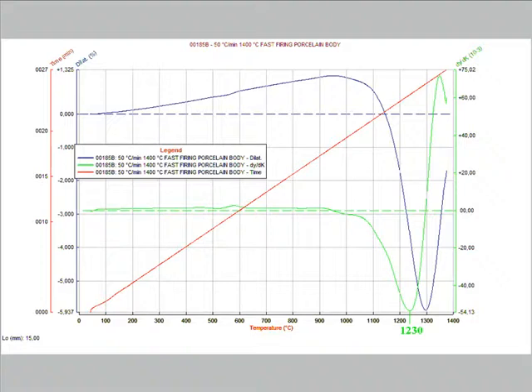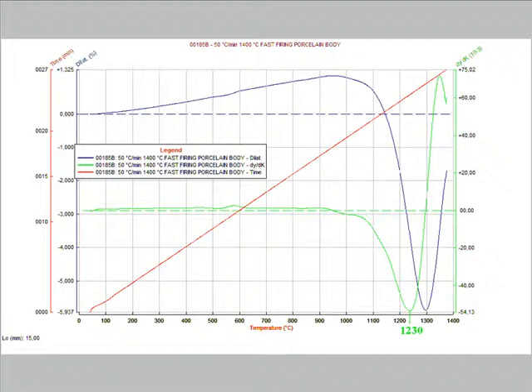Running a test with constant heating rate up to bloating, it is possible to identify the temperature of maximum sintering rate. This temperature is identified by the negative peak of the first derivative of the sintering, or the sintering speed, which is the green curve. In this case it is 1230 degrees.